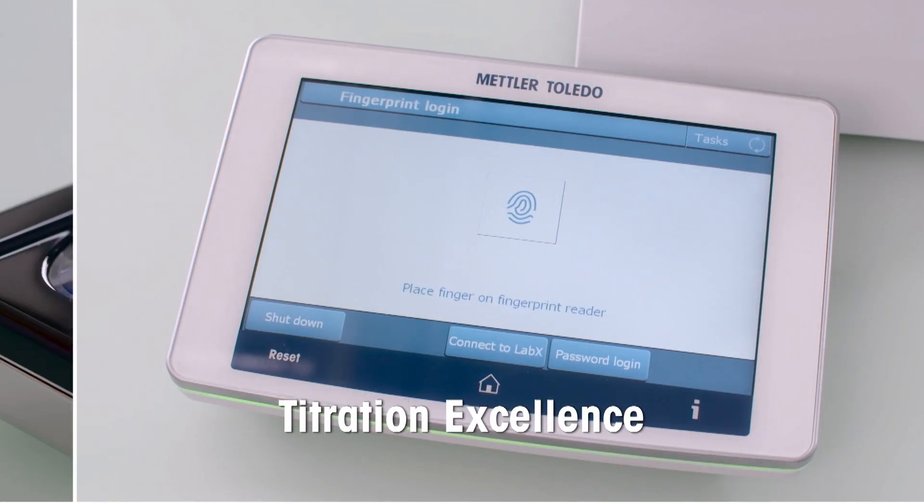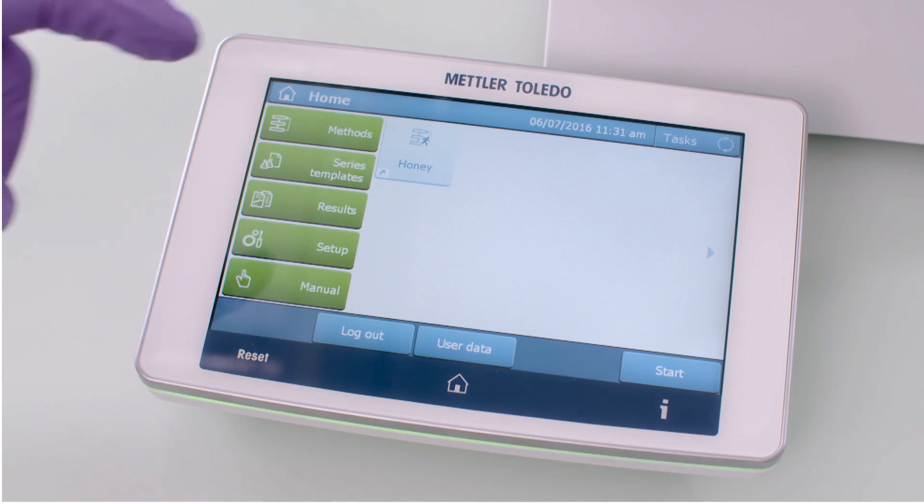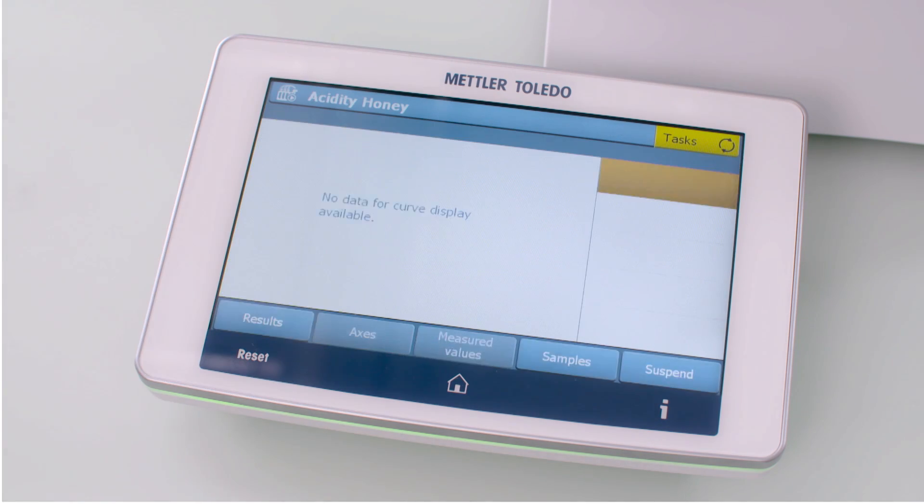The lab operator can easily log into the titrator via the fingerprint reader. With just one click, the honey method can be started.